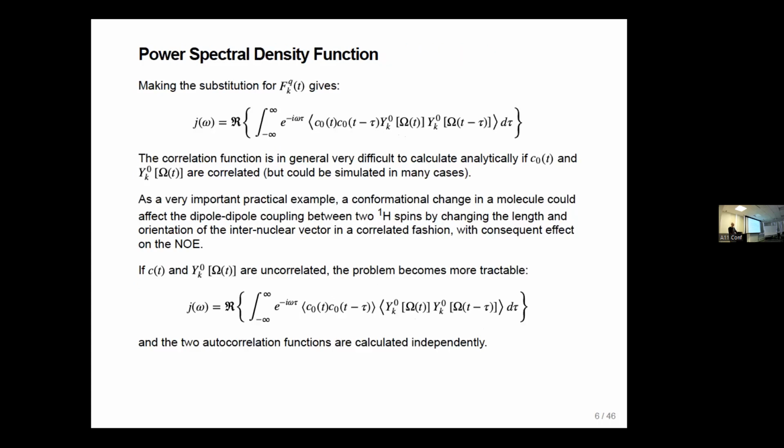My tensor of interest is CSA. If I'm looking at the CSA tensor, then do these coefficients C not become time independent? So if you regard the CSA as being a constant, then these C's become constants. But they may not be constant. Well, the chemical shift anisotropy, I think, to a very good approximation is constant in the absence of chemical changes.